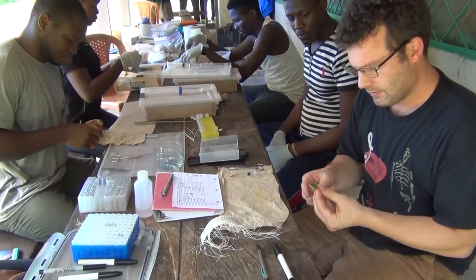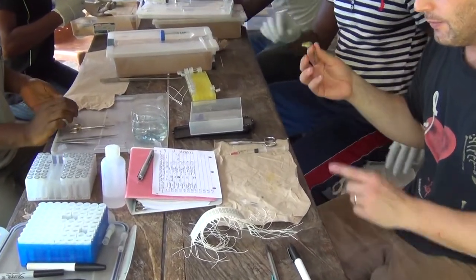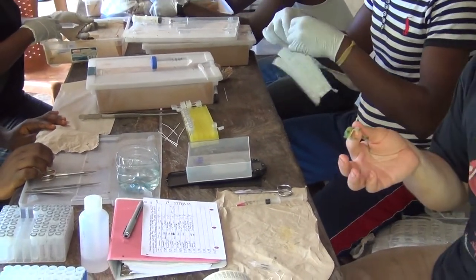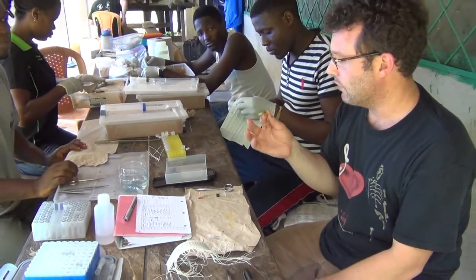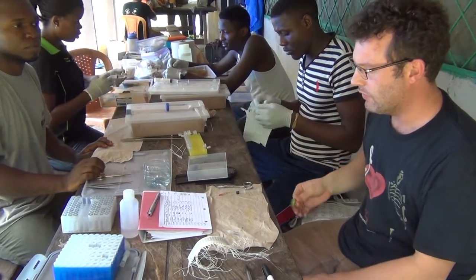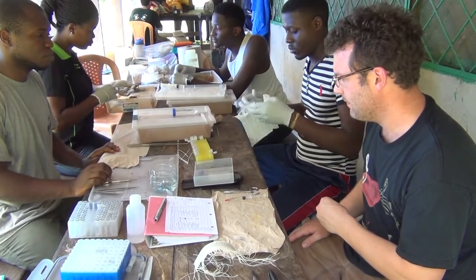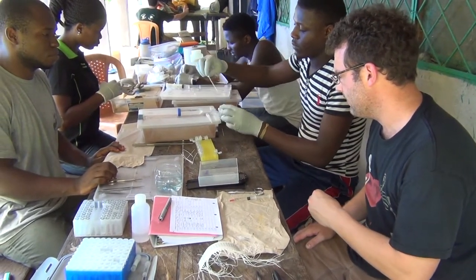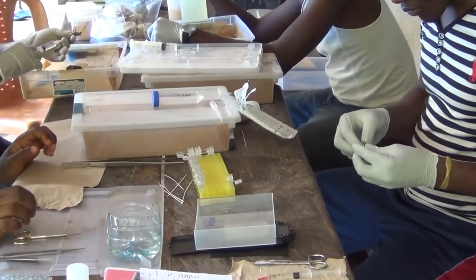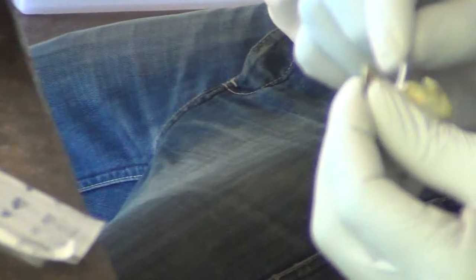So we have Leptopelis brevirorostris, and I am going to hand it off to Lovett while he does swabbing — I am going to take field notes on it. The first thing that we do before we euthanize the frog is do a sample for chytrid. Lovett is going to swab the frog for chytrid.